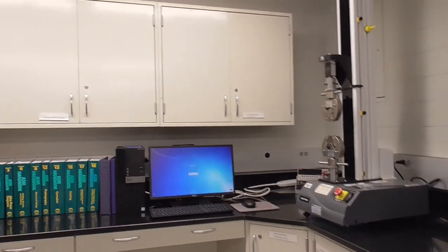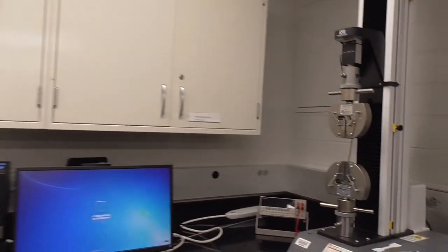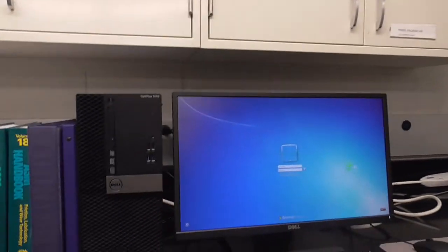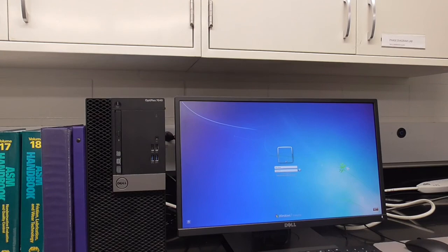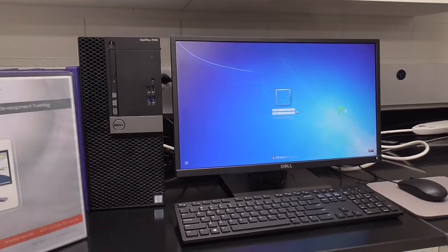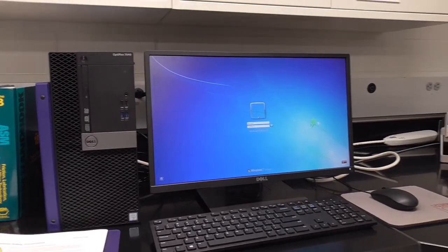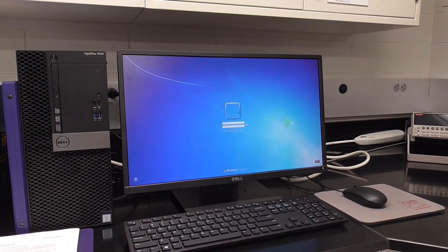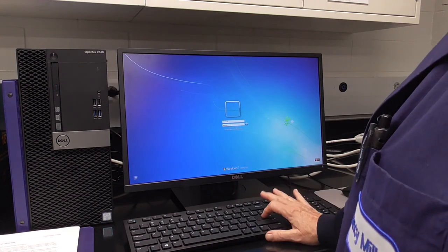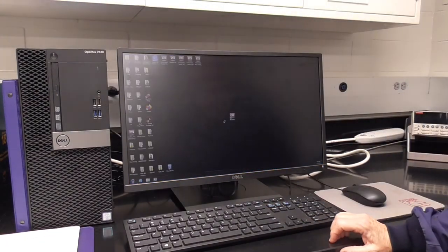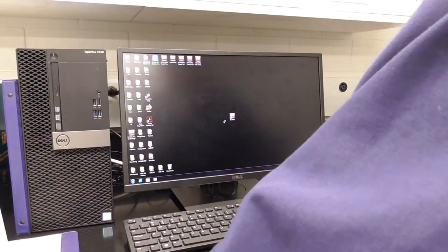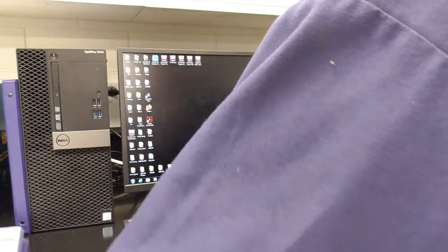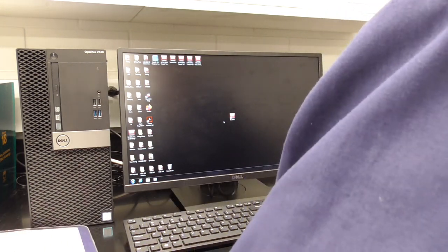When you come into the space, you will find the manual next to the computer. Here. And there's the password you need to put in the computer. So get the password in there. The manual also has detailed instructions on how to run the instrument, and here is our department SOP with help for the software.